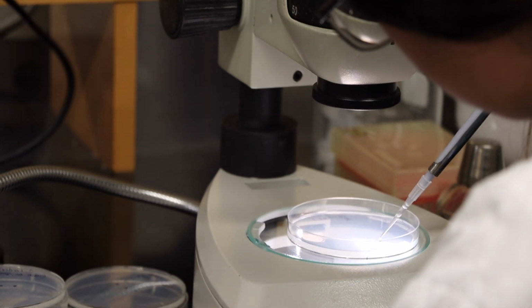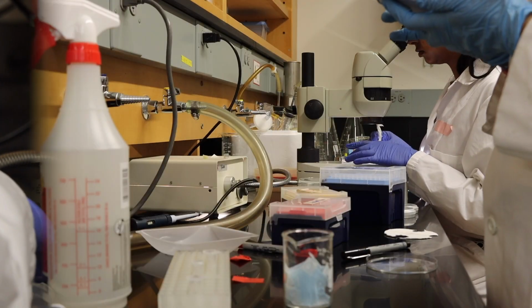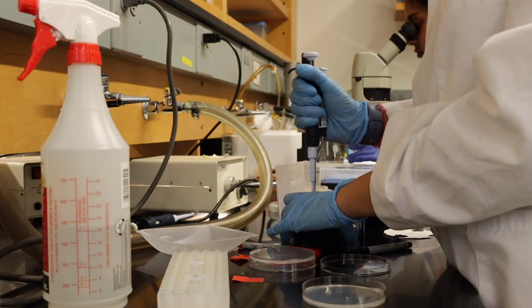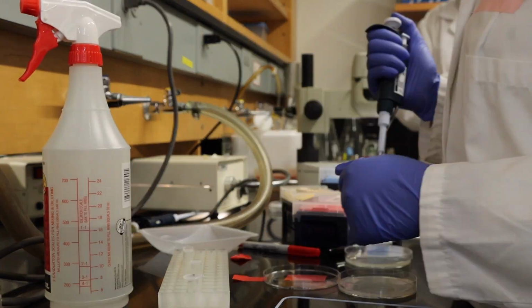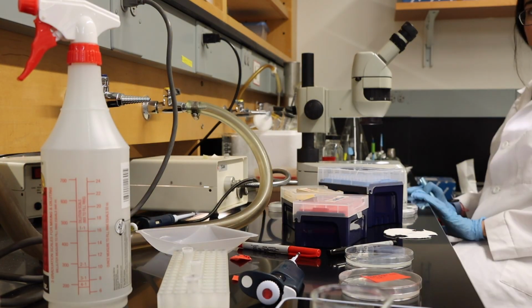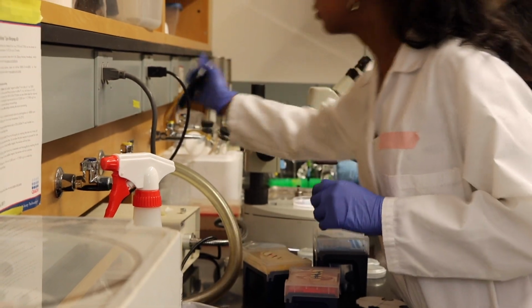Subsequently, the worms are removed from the worm trap with 30 microliters of NGM buffer and then are placed onto the chemotaxis plate. After 2 hours pass by, the number of worms in the isoamyl alcohol circle, the ethanol circle, the worms outside of these circles, and the worms in the starting point are counted. The chemotaxis index is then calculated accordingly.